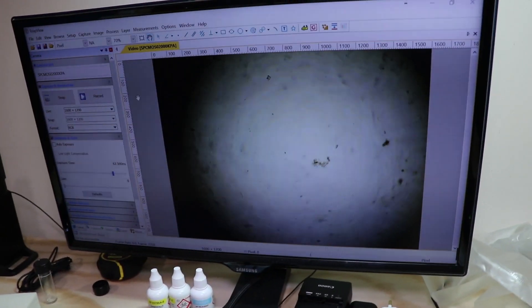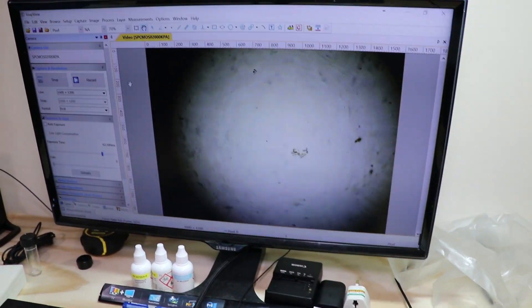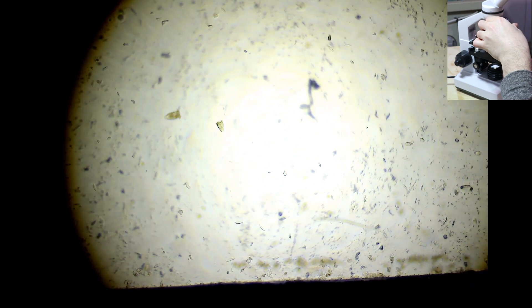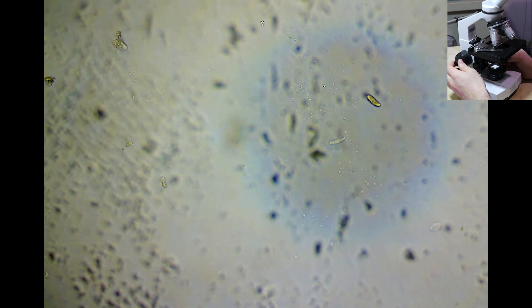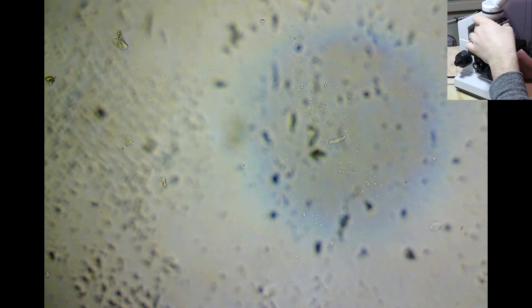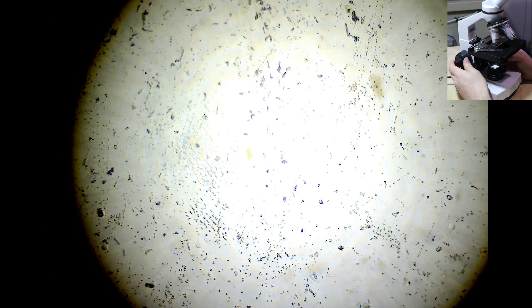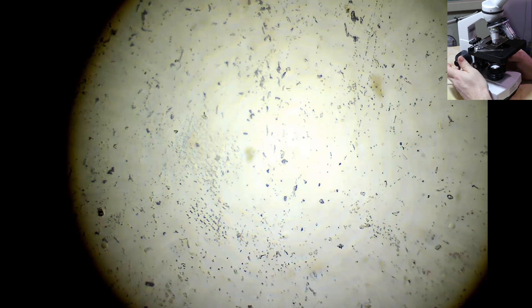So let's have a look around this slide and see what we can find. We're on 40 times currently. I like to actually go to the edges of the slide first, because I find that the edges of the slide are the best places to find things. Look at that, that's something. That's a quick mover. It's a weird little thing, isn't it? It's just a dot, but it's a quick mover. So it really shows you what you can find in any amount of water.